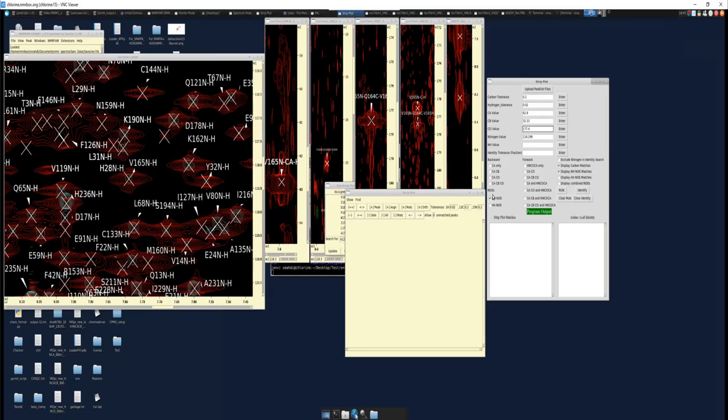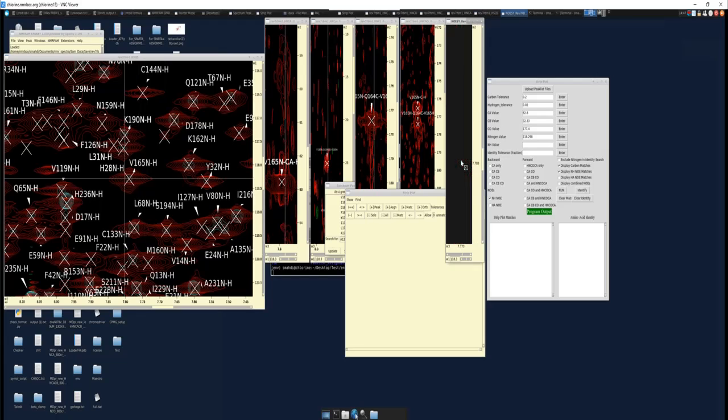Now you'll notice for NOEs there are two options. There's the NH, which is quite self-explanatory. This searches the amides that you have, so it searches between a region of 6 ppm and 12 ppm for matches. But there's also an H-alpha option, right? So sometimes your H-alphas will also be shared, right? The amides are going to be close to the H-alphas for your I and I-1s.